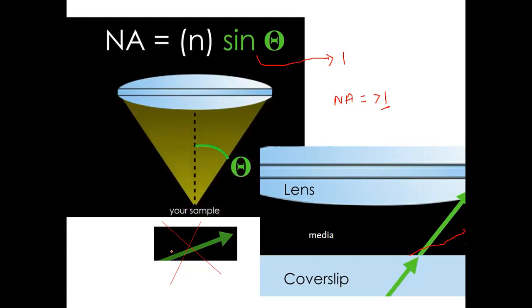So when you compare all these magnifications or the objective lenses, usually we see that the oil immersion is the best one, because it has a numerical aperture like 1.5. So again, the numerical aperture is the maximum angle of the light coming from your sample that reaches your lens, and the lens collects the light traveling at an angle through the cover slip.